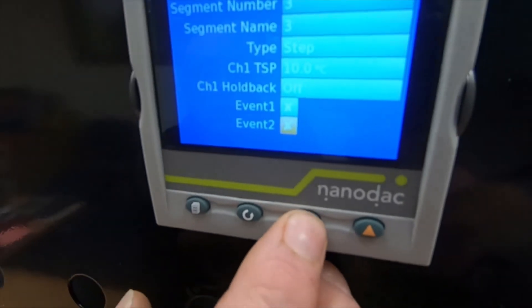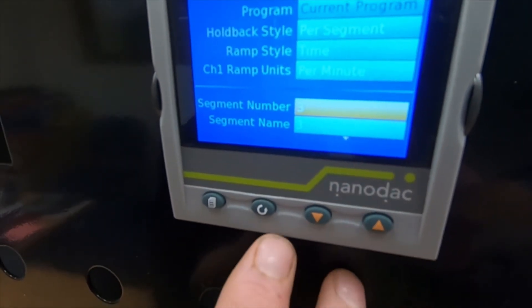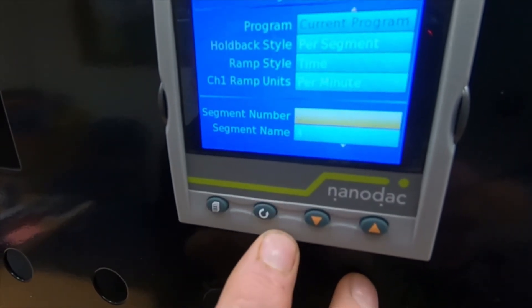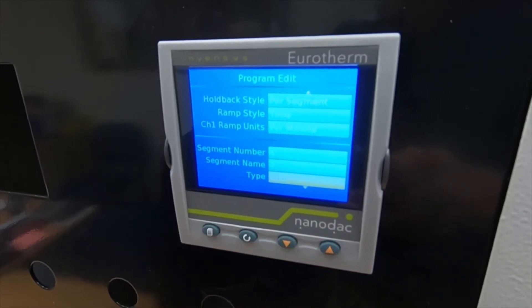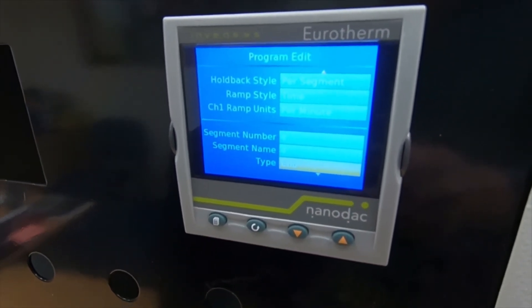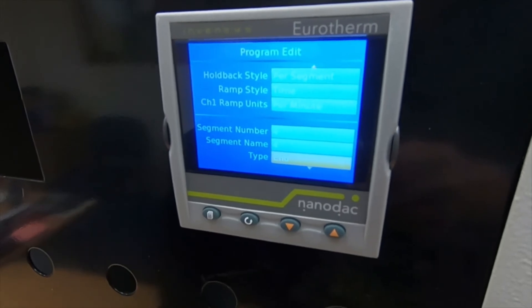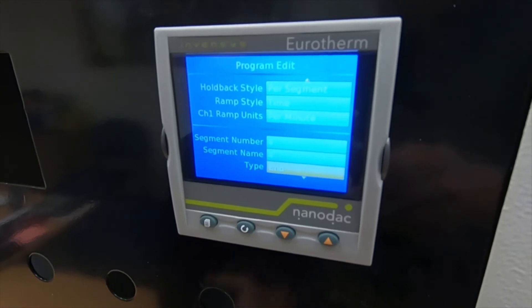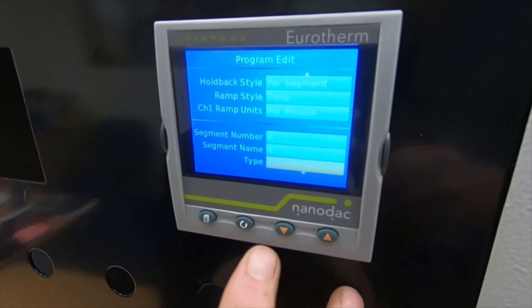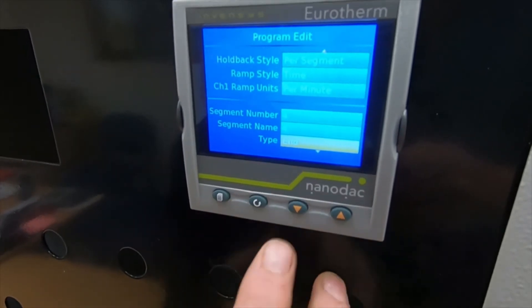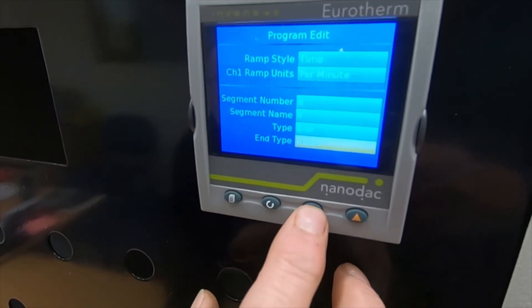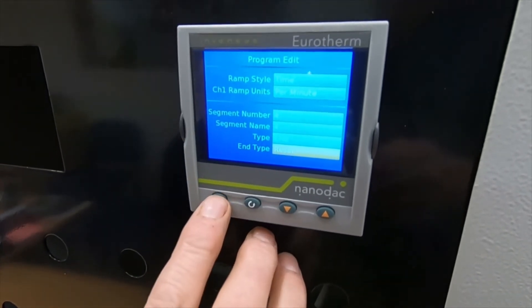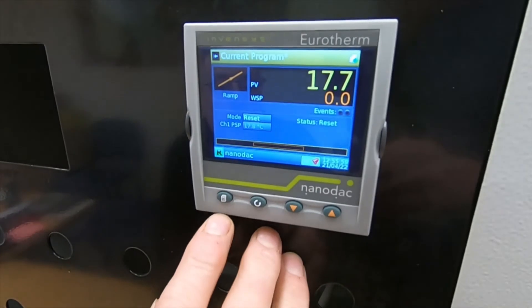Now we want one more segment. Highlight again, change that to four, and accept with the scroll button. Scroll down — type: end. That's an end reset, meaning it will reset your program back to its original settings ready for the next time you want to run it. Lock that in — it says end type reset. So now you've done your programming; use your page button to come out.